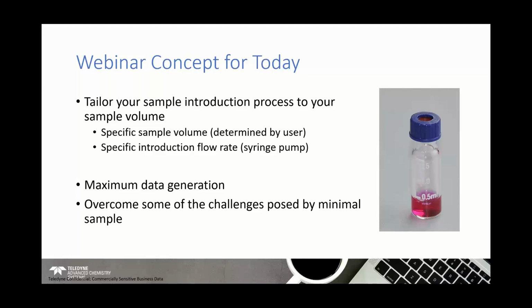Is it a maximum amount of data? Is it a specific analyte suite we're interested in? Or is it something different, like precision, in the case of what we'll discuss today? Then we set up that system, tailoring it to the introduction so that you overcome some of the challenges you might have with conventional approaches to introduction.